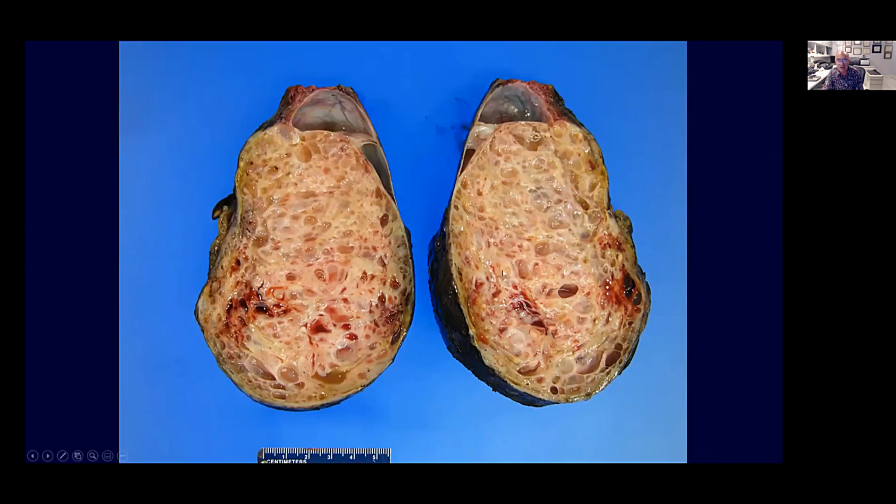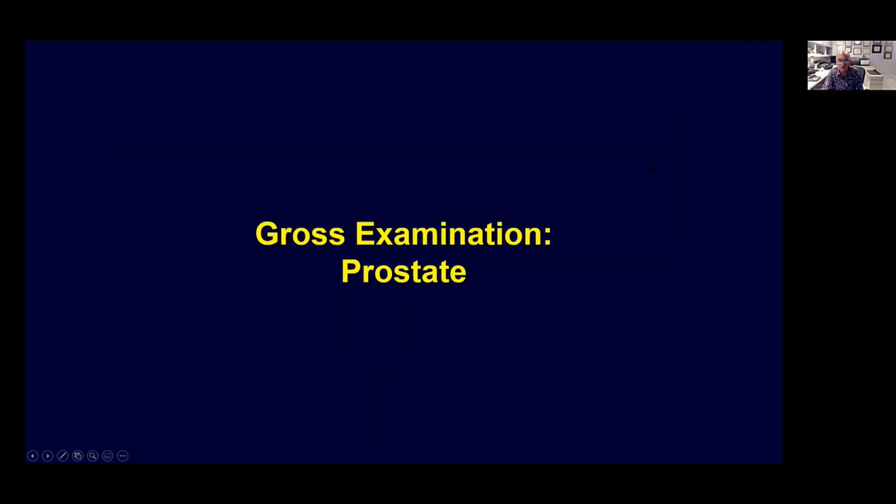And this is another typical appearance of what is called a teratoma, with all these cystic appearances that are typical, and also replacing basically almost 100% of the testicular parenchyma, with some cystic formations here in the epididymis.